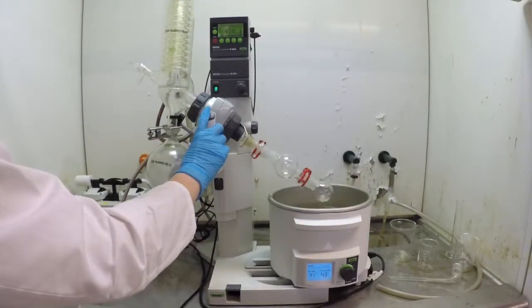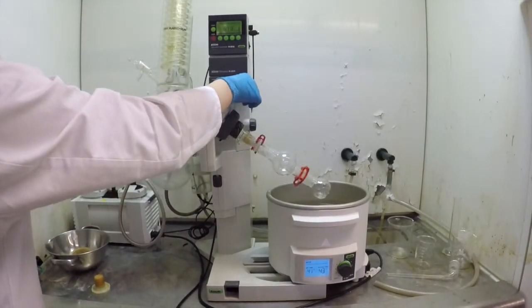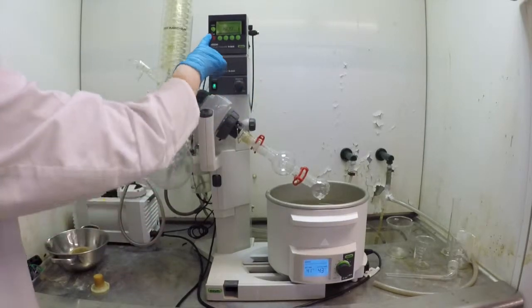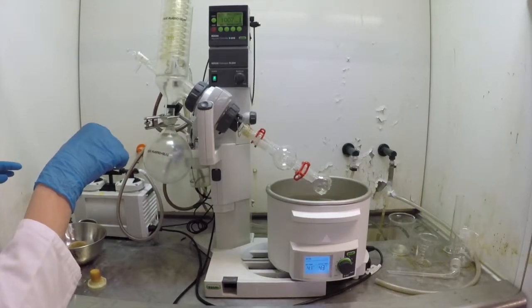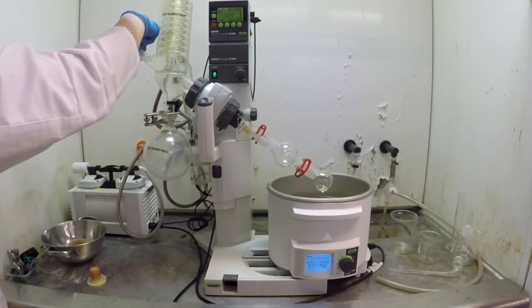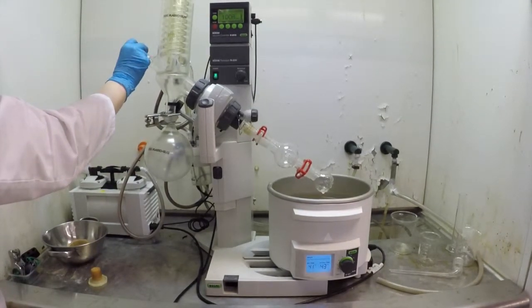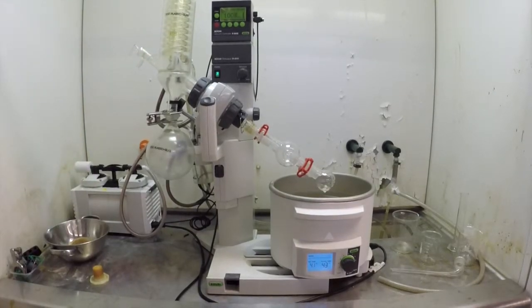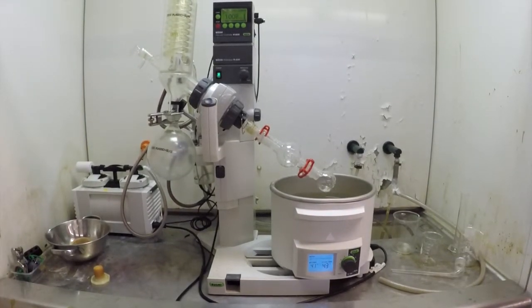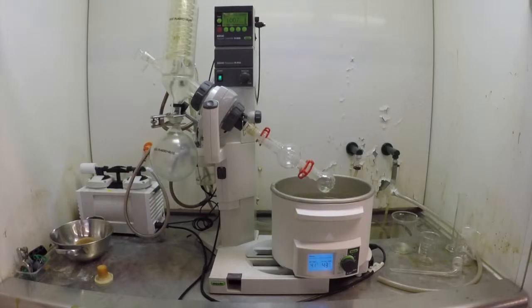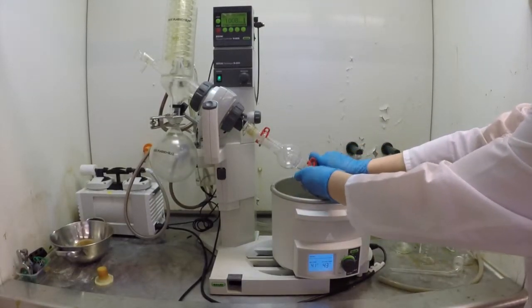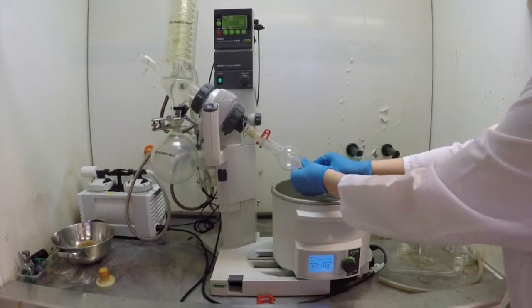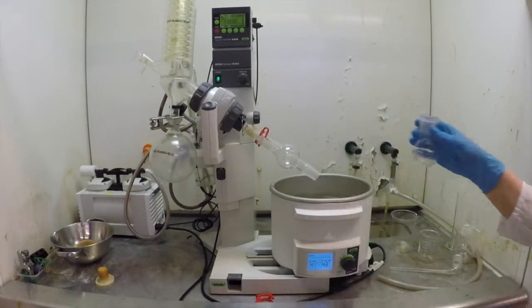Lift the flask out of the water bath. Turn off the rotation. Press the stop button. This will increase some of the pressure in the system via the pump. Open the system to release the rest of the pressure. Remove the clamp and the flask from the rotavapor. Stop the cooling system by turning off the tap.